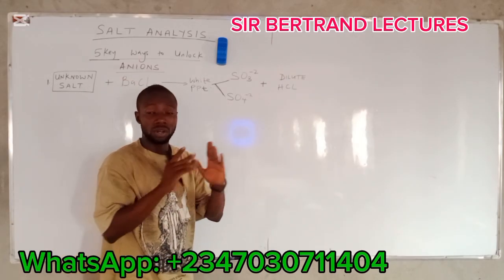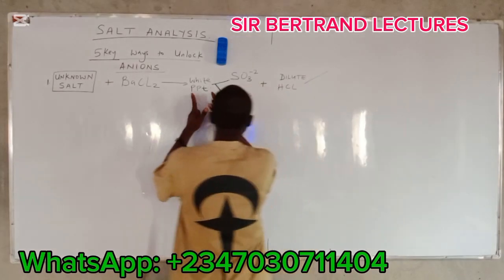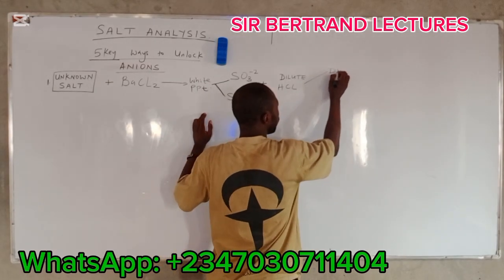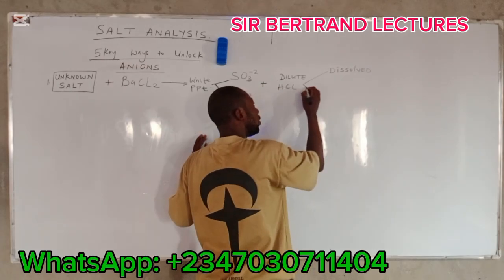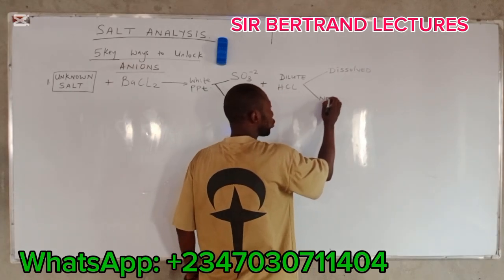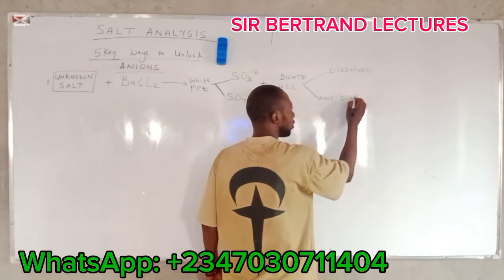After you have added the dilute hydrochloric acid, look at what is going to happen. One of these two I'm going to write on the board is going to happen. It's either the precipitate dissolves, or the precipitate does not dissolve. Do you understand?